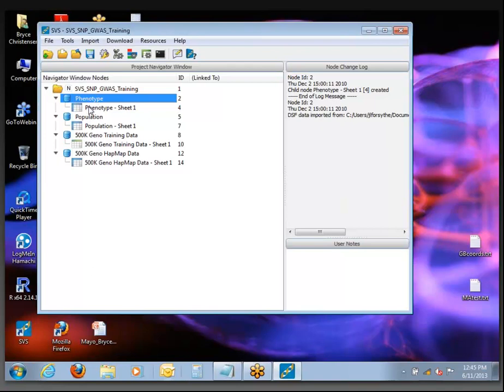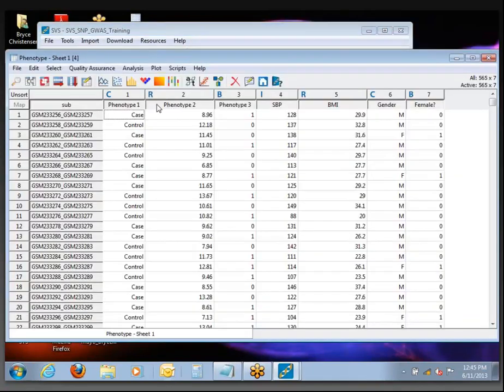If you double-click on the first node, you should open up a spreadsheet that looks like this. You can wave at me when you successfully open the spreadsheet so I know you're all keeping up.